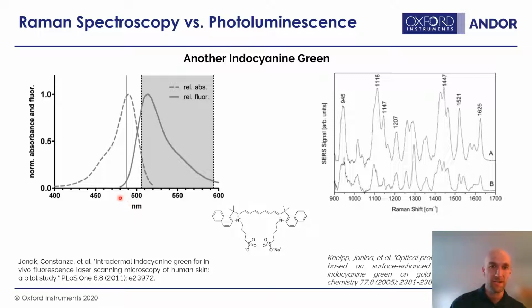But just to give you another view, here's the fluorescent spectrum, photoluminescent spectrum. Here's its absorption. This is sort of the excitation for that fluorescence. And these are both blobby spectra. Again, I'm just making the point that photoluminescence has a relatively unstructured emission or unstructured spectra associated with it that are hard to separate. They all look very similar. Or, I'm sorry, that's a gross generalization. Many of them look very similar.